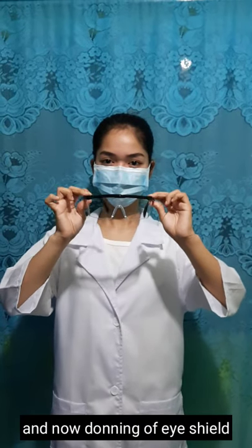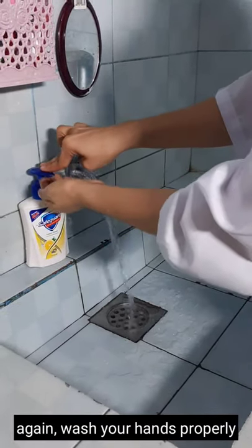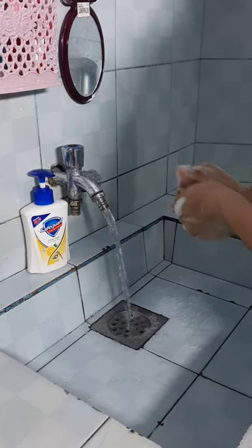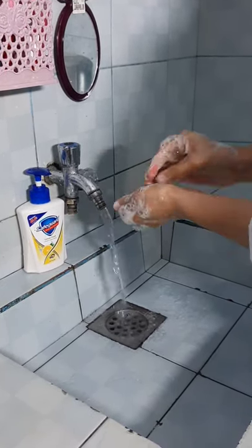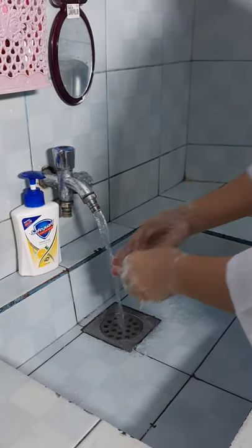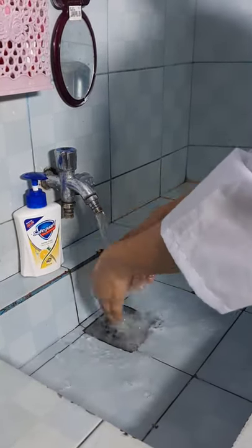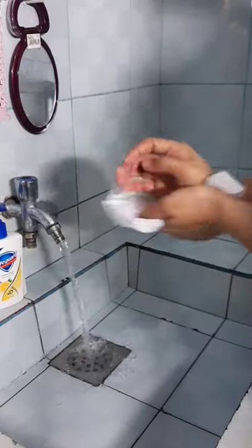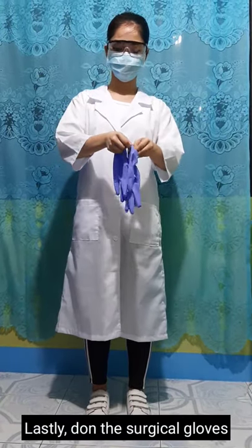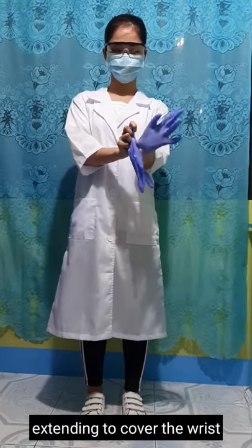Now, don the eye shield. Place it over the eyes and adjust to fit. Again, wash your hands properly. Lastly, don the surgical gloves by pulling each glove on and extending it to cover the wrist of the gown.